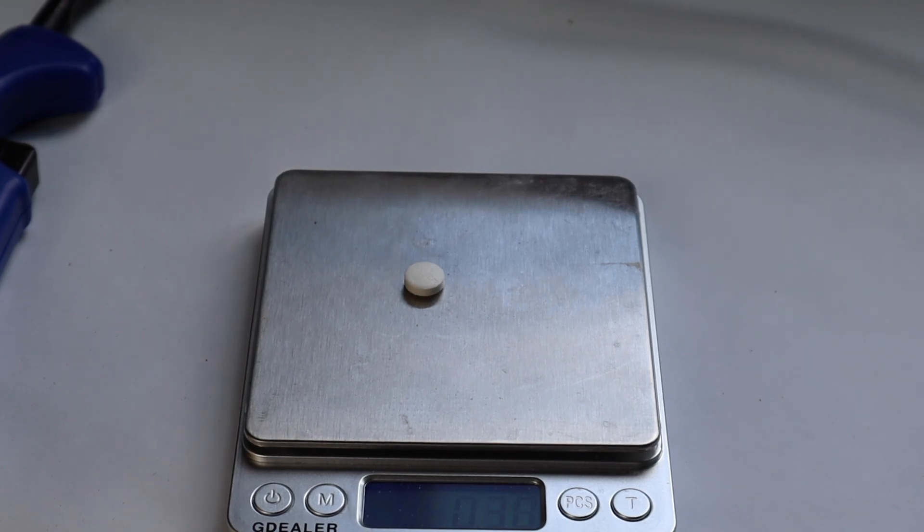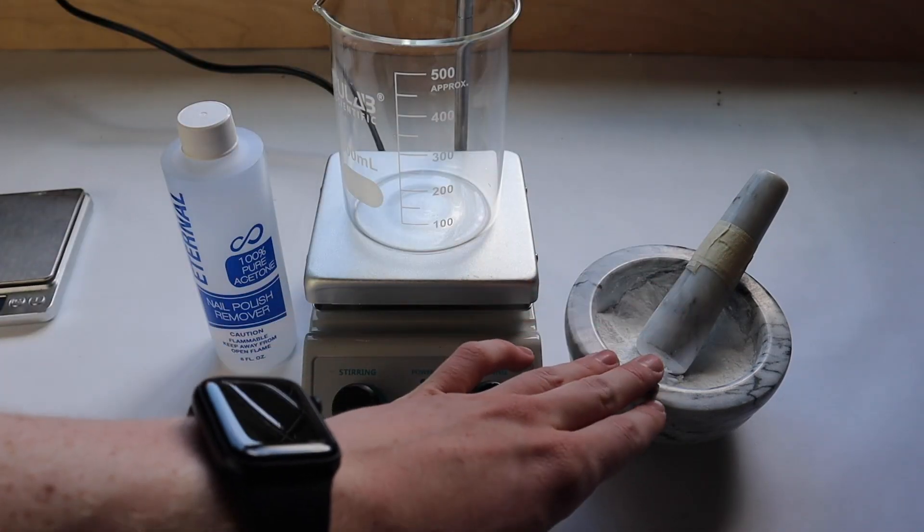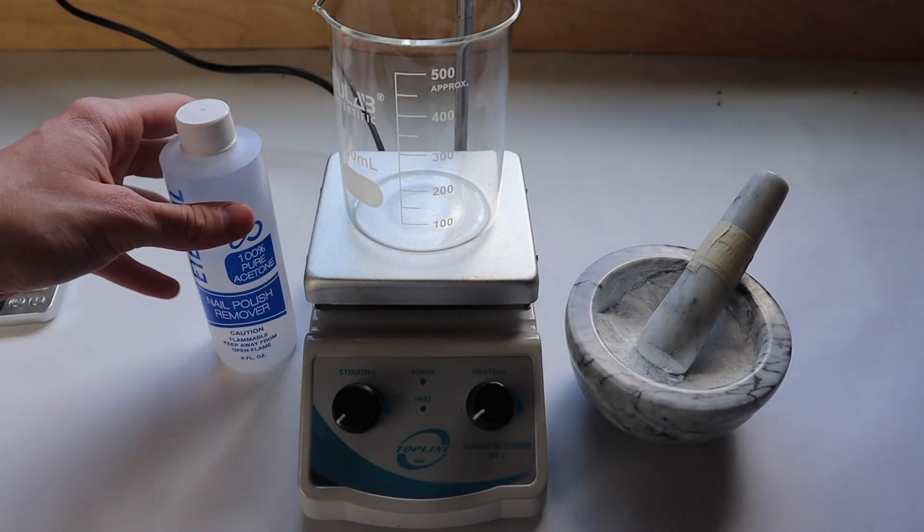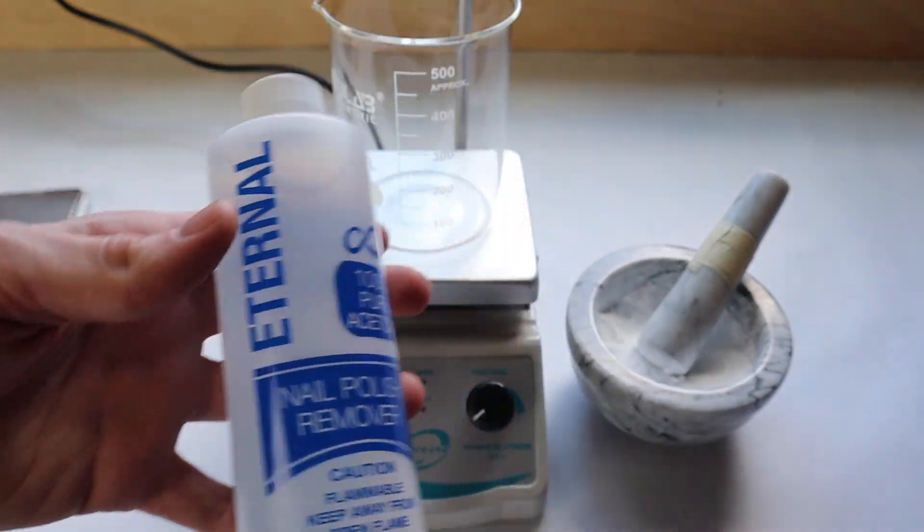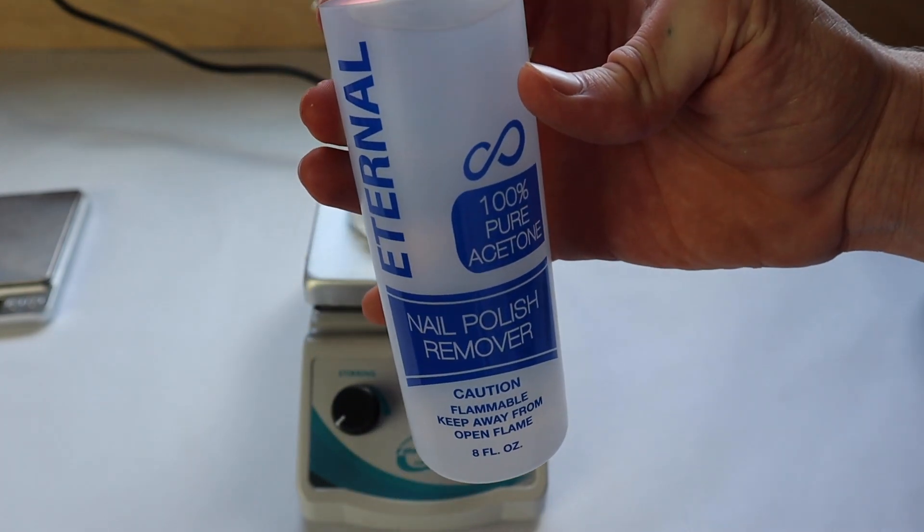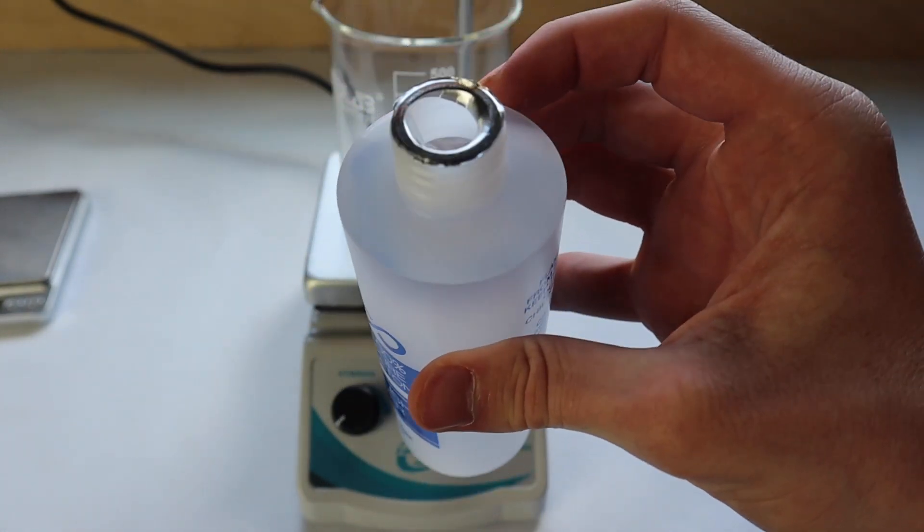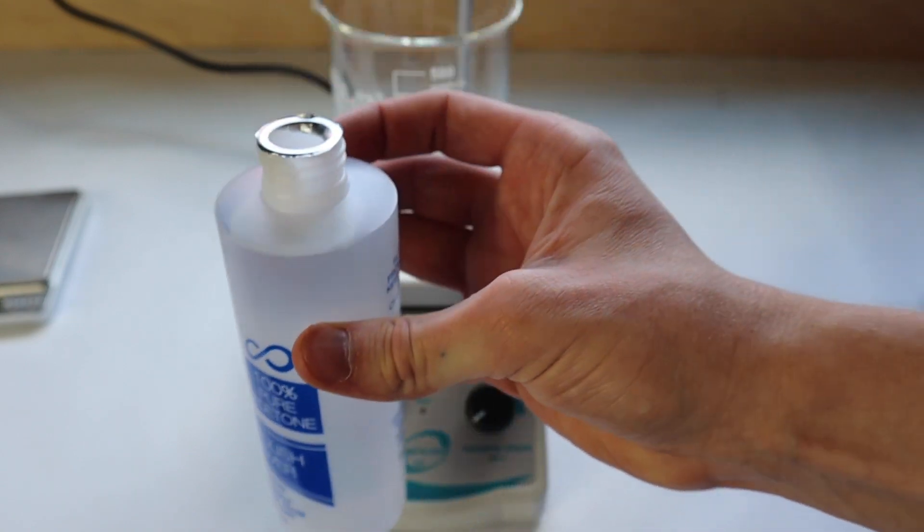The next step is to dissolve all of the acetylsalicylic acid with this acetone. This container is a little bit smaller than I expected, so that's going to make our percent yield probably worse than it should be. I never realized how light acetone really is. I know its density is a little bit less than that of water, but it just feels like it's not even half that of water.